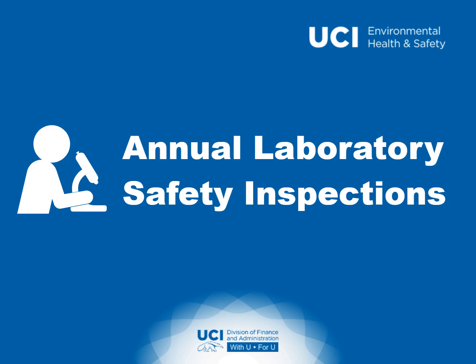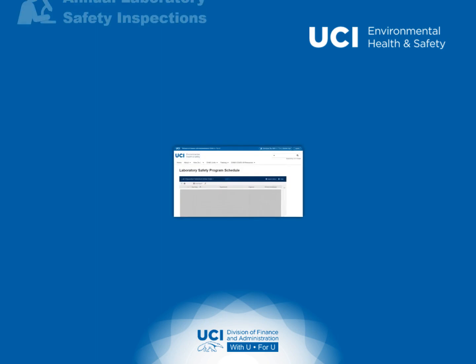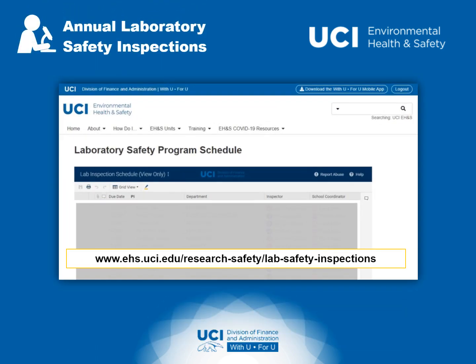Lab safety inspections will now be conducted annually by Environmental Health and Safety. The annual schedule is posted on the Lab Safety Program page on the EH&S website. EH&S will contact you or your delegate to schedule an inspection.